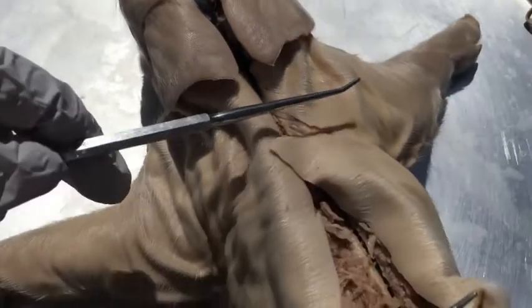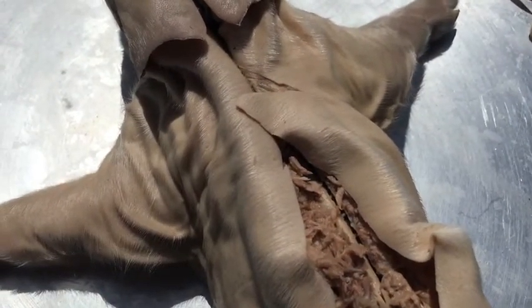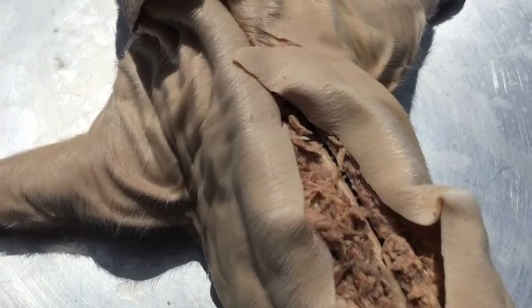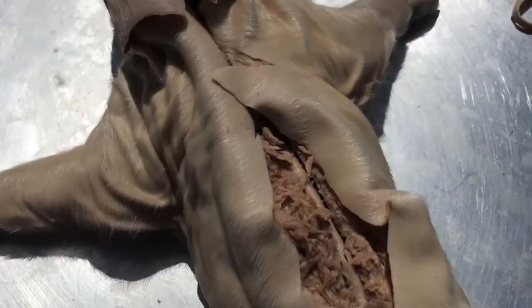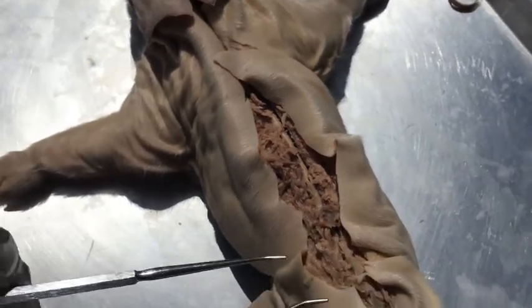And next we have the thoracic spinal nerves, which are going to control this portion of the pig and basically all the organs and movements within the chest area. Next we have the lumbar spinal nerves, which are going to be this portion of the pig, and that's going to be responsible for nerves within the lower back region that control movement from there.